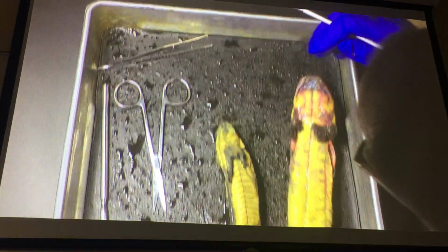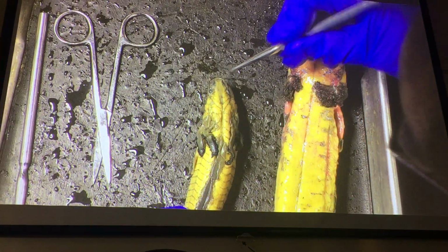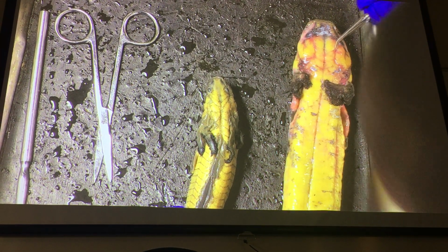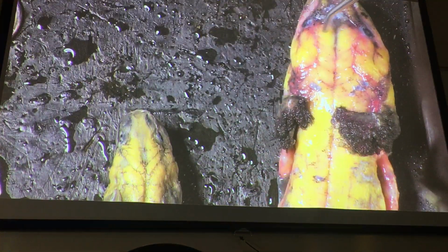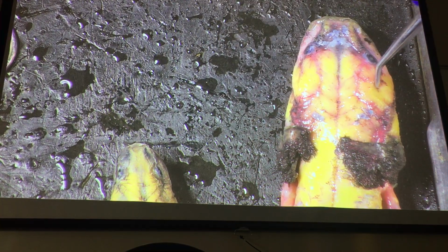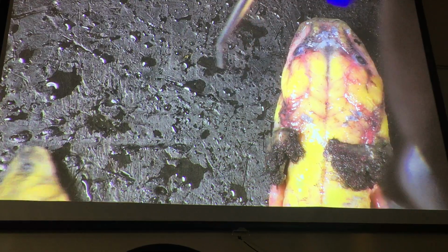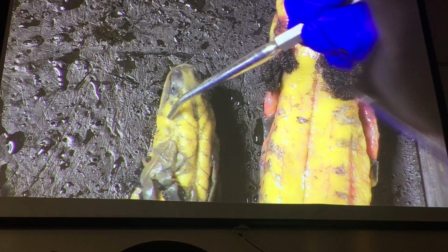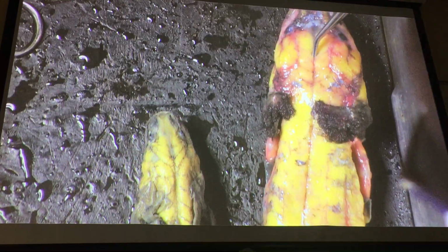All right, let's start off with the head. So I think the head muscles are easier to see on the mud puppy than our little tiger salamander. But we got these two muscles right here. We've got the anterior mandibular levator and external mandibular levator. And then of course on the side of the jaw we've got the mandibular depressor. So we can see that depressor here. We can see our anterior and external mandibular levators, but they're just not as well defined as they are here, and a little harder for you to see.